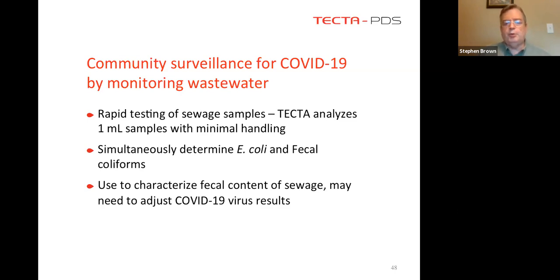And that's going to be important because when you get a sewage sample and you want to test it for the virus, it's important to know how much fecal content is in the sewage. The virus is going to be at higher levels on days when, for instance, there's not a lot of rainwater going into the sewer system and diluting it. So it's important to understand how much fecal content is in the sewage so that the virus test results can be corrected to adjust for other environmental events that might be affecting the results.